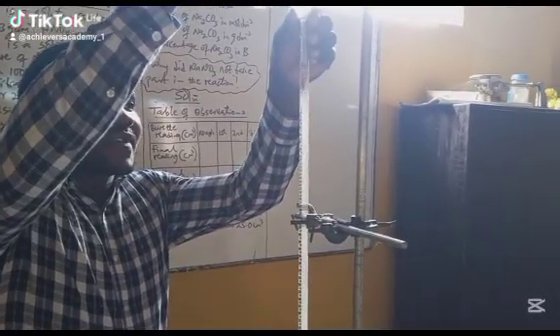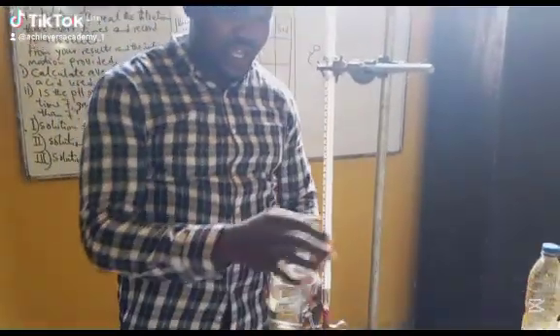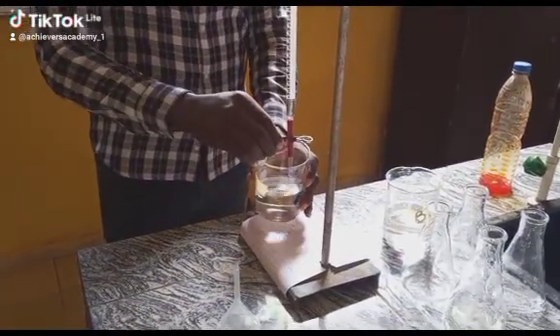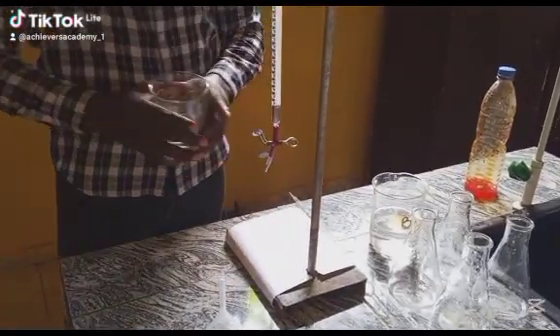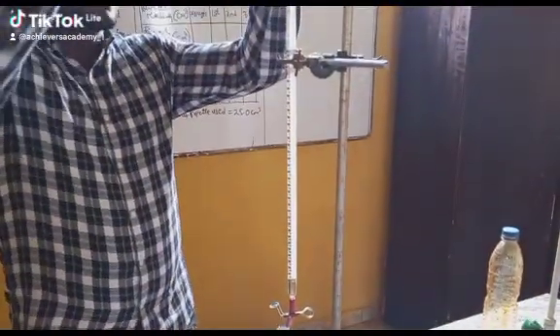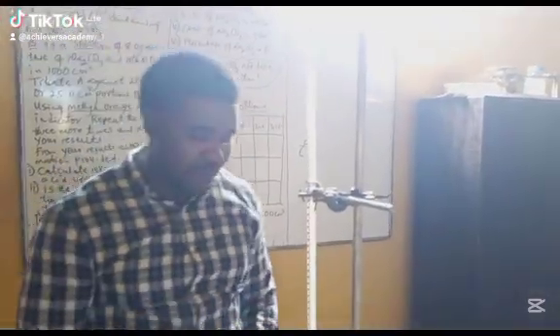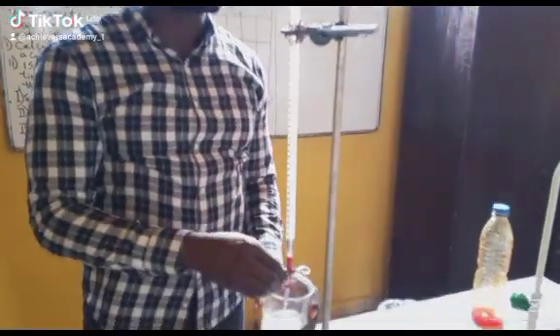Okay. Now the first thing I'm going to do here is to make sure that the acid fills in the jet, because this is still empty, right? So by putting the beaker for acid on it and then releasing it, so that the acid goes into the jet. Now I can now fill in the burette again to 0 mark. All right. Can fill into the 0 mark. Remember, after any point, you remove your funnel. Then let's carefully fill it into the 0 mark.